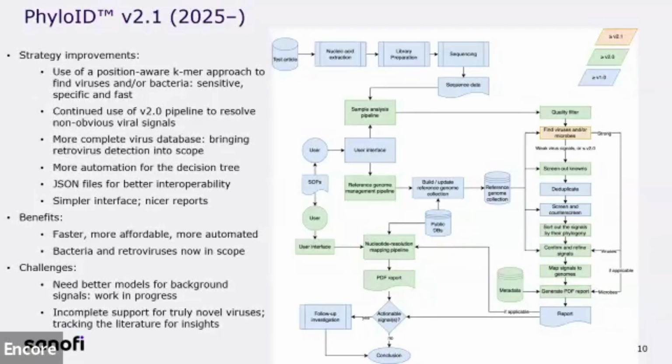Some of those are tentative matches. They get run through the regular pipeline. But now the pipeline is working just with the needles. It doesn't have so much host pre-screening to do. So it's, again, faster.